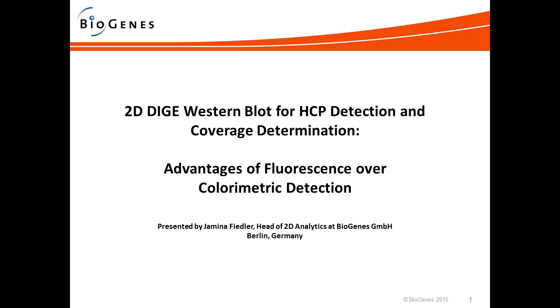Do you find any difference between wet transfer and semi-dry transfer of the membranes? Well, it's very difficult to do wet transfer on such a big gel. So actually, we haven't done tank blotting with these big gels. We've always done semi-dry blotting.